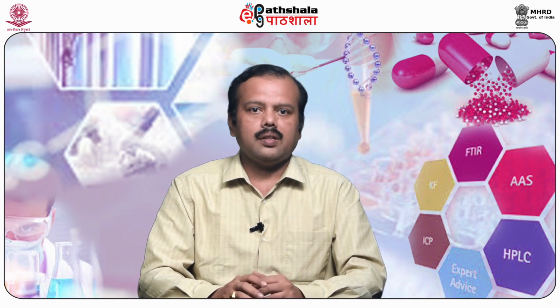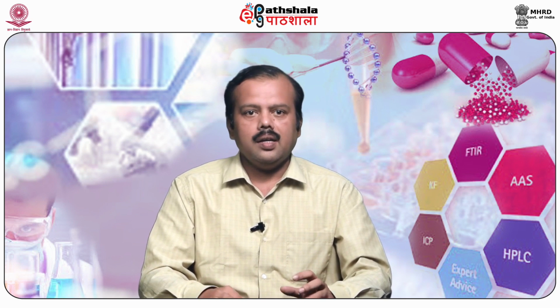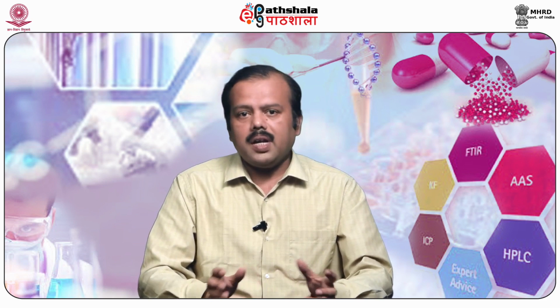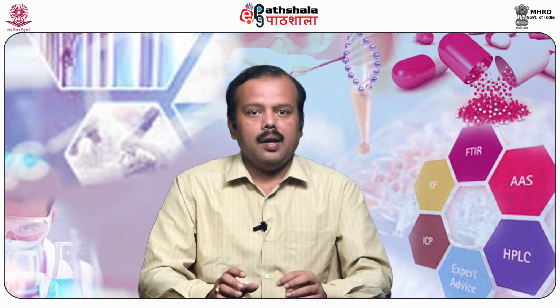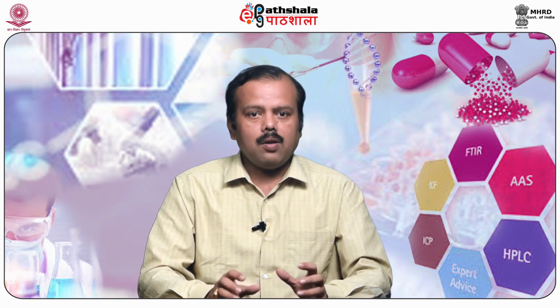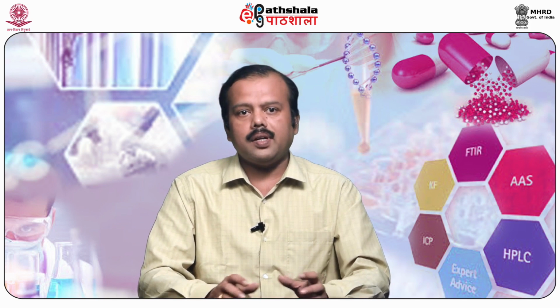The inhibition of microbial growth under standardized conditions may be utilized for demonstrating the therapeutic efficacy of antibiotics. Any subtle change in antibiotic molecules, that is in chemical structure, which is not detected by chemical methods, can be revealed by a reduction in the antimicrobial activity. The microbiological assay is based on comparison of antimicrobial activity.